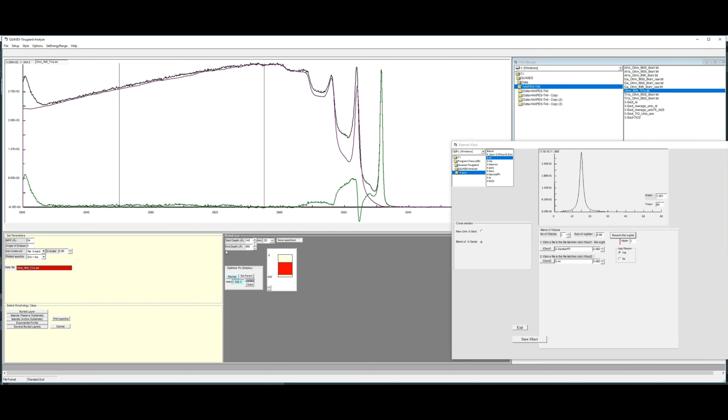We could also use simplex here, maybe in this range, to see what that gives. And it gives slightly different values, but very close to these values. And they are very close to what we got with just adjusting the 3-parameter cross-section. The end result doesn't vary much from that.